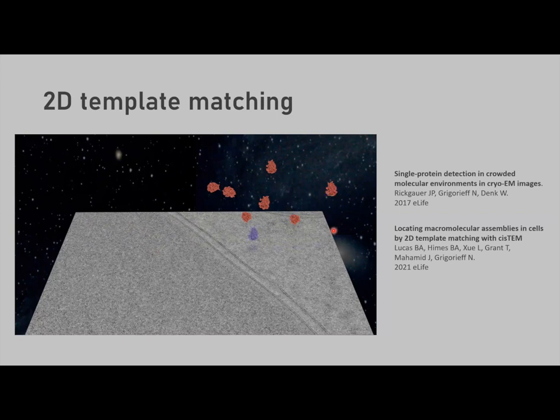And so with these results, we can basically build up a 3D model of the location and orientation of this molecule in 3D space. And so we get very accurate X and Y information, and we actually can even get the height or the Z position of the molecule in the lamella by basically varying the defocus of the projection. And it turns out the cross correlation is very sensitive to that. So you get fairly accurate Z positions.